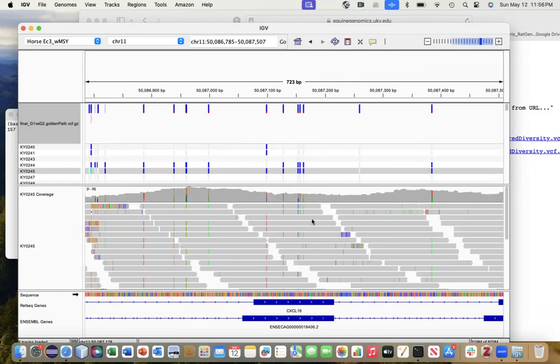And what we see here is that these four polymorphisms are in fact found in a single read and therefore on the same haplotype. And then this other fifth polymorphism here is on a read with no variation relative to the reference. So it is on its own haplotype. That was something that could be resolved pretty quickly by simply getting to the BAM data set.